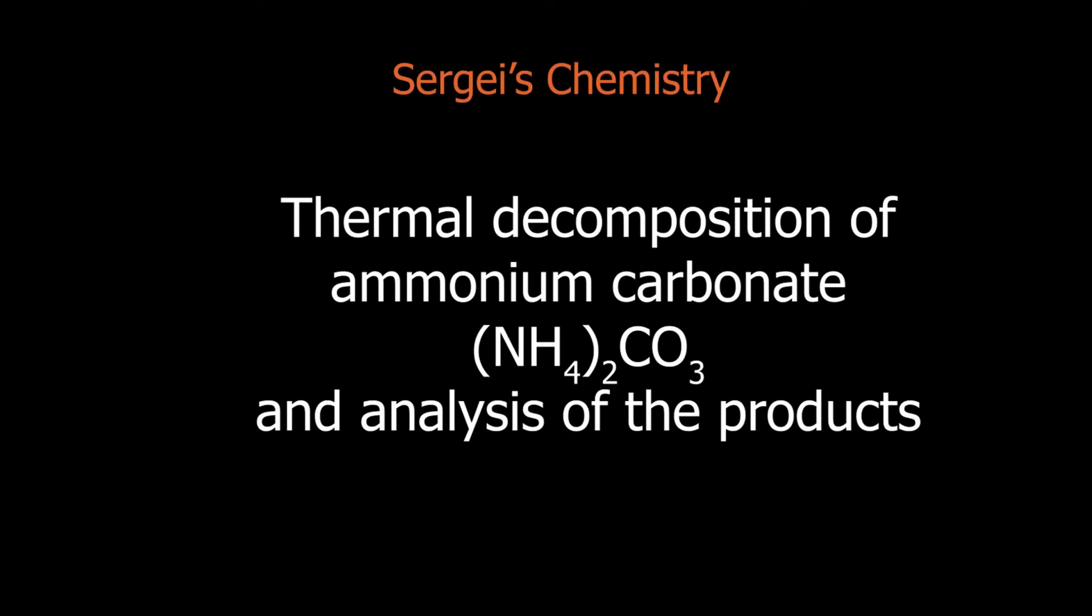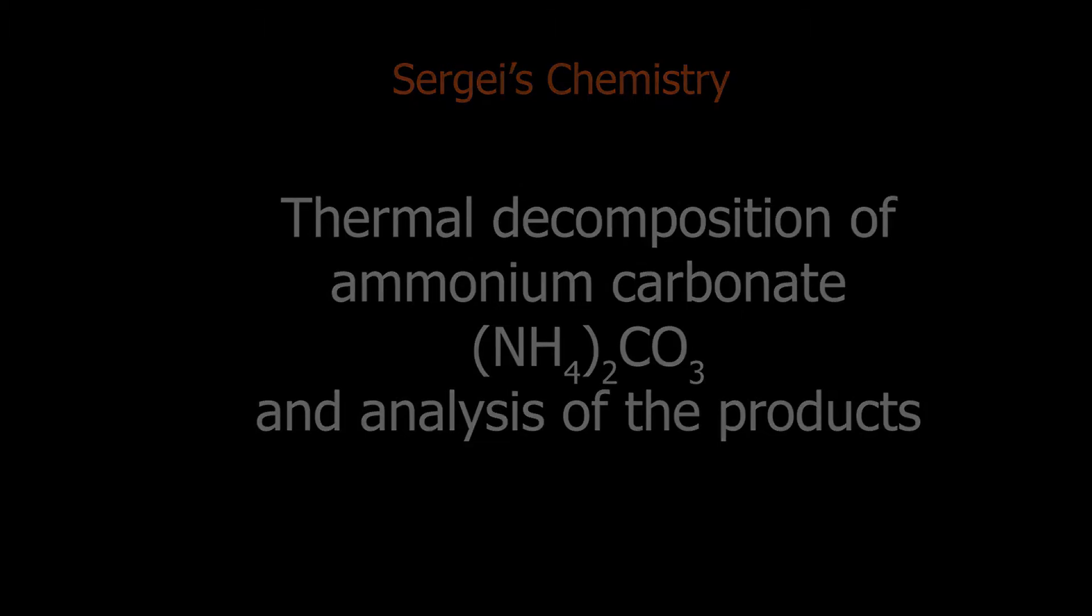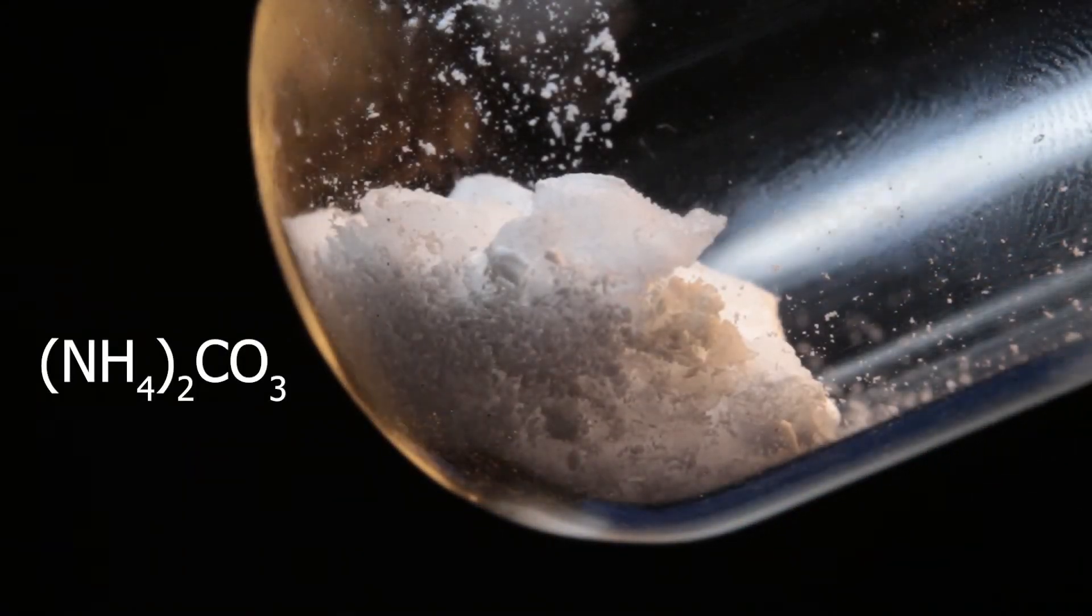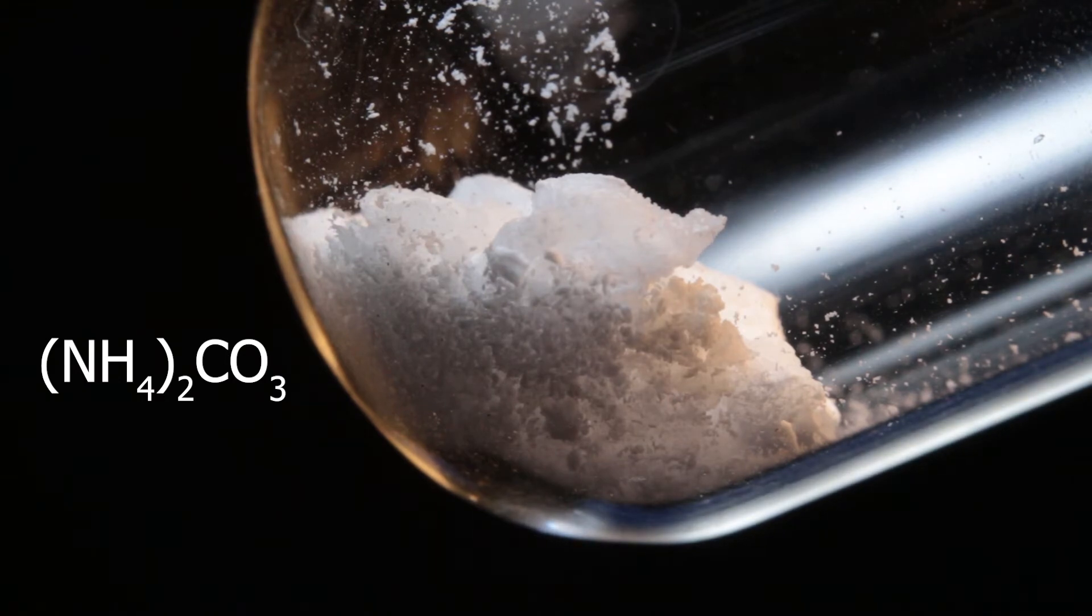Welcome to Sergei's chemistry. Today we are going to look at thermal decomposition of ammonium carbonate and analyze the products of decomposition. Ammonium carbonate is a white solid. Let's see what happens to it when we heat it up.